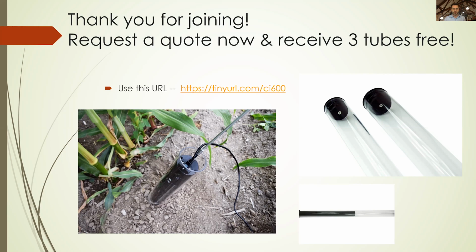Do you have microtubes to insert in pots 3 centimeters by 3.5 centimeters in height? No, we do not. The shortest tubes we have are 1 meter. We do provide other lengths of tubes, and I think you saw a few of them, but we definitely want to make sure that the full scan head, which is 34 centimeters by 6.35 centimeters, is able to do a full rotation.